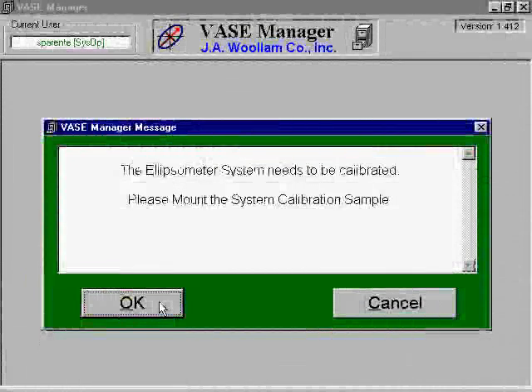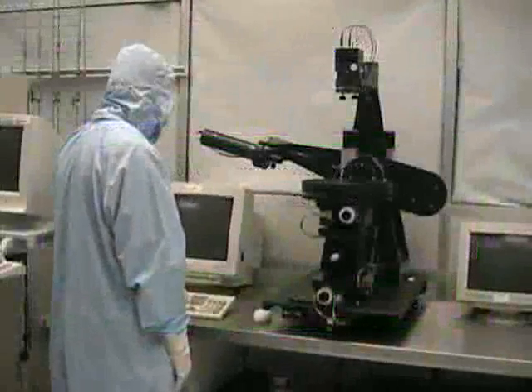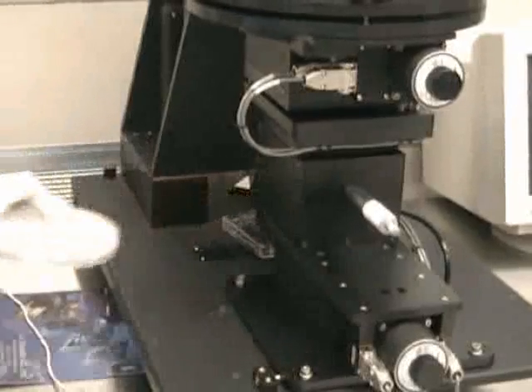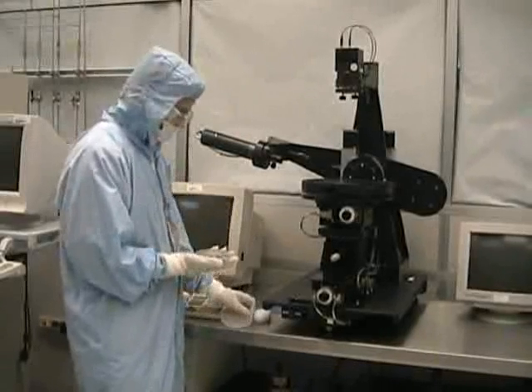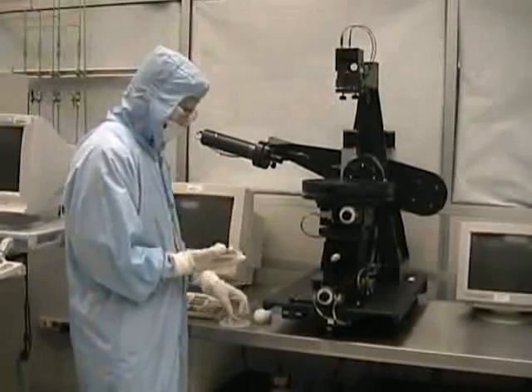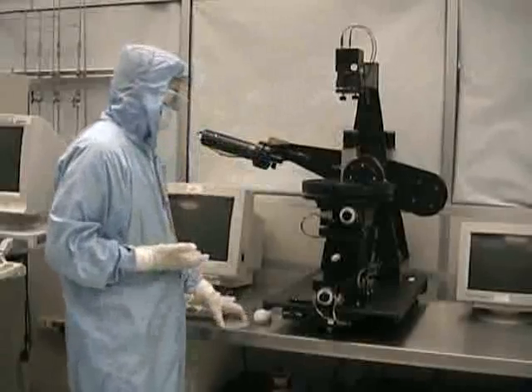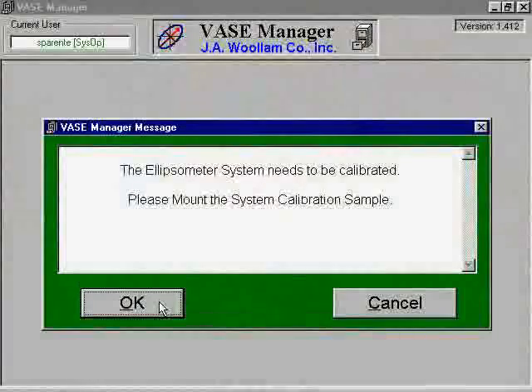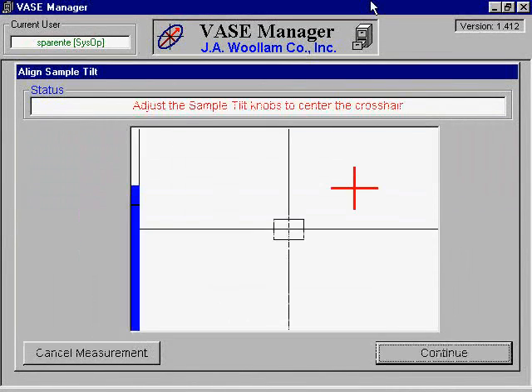If you see a screen telling you that the ellipsometer needs to be calibrated, then you will need to perform a calibration before continuing. The calibration will either begin automatically as the system senses it needs to be calibrated, or you can choose calibration from the software configuration screen. The system will prompt you to mount the calibration wafer onto the sample stage. The calibration wafer should be in close proximity to the ellipsometer and is clearly marked. Follow the on-screen instructions. Setting up the calibration wafer for a scan consists of the same basic steps as a normal scan.